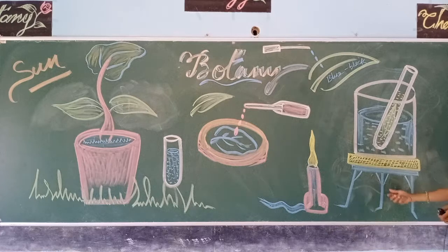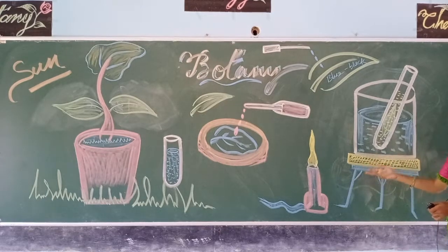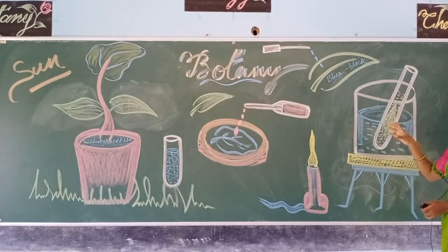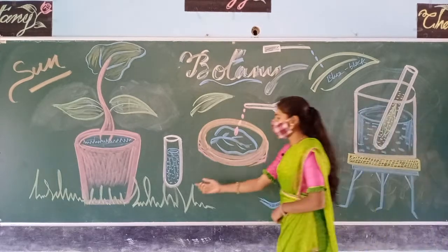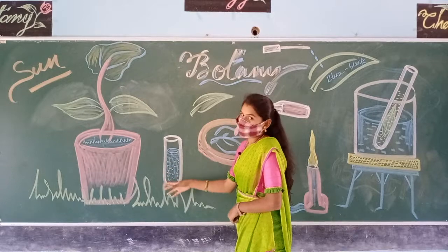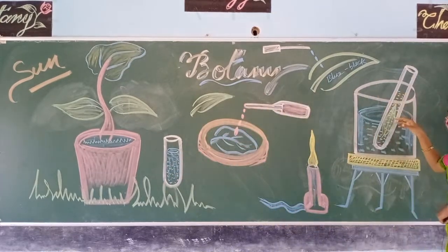Next, take a tripod stand and place a gauze on it. Upon this, place a boiling beaker filled with water. Then place the test tube — containing the mature leaf and spirit — inside this beaker.